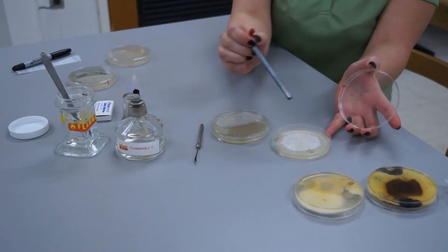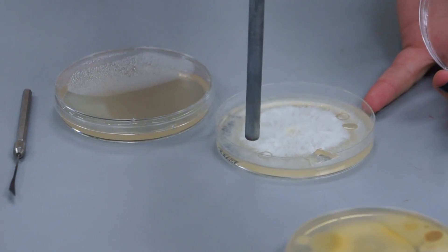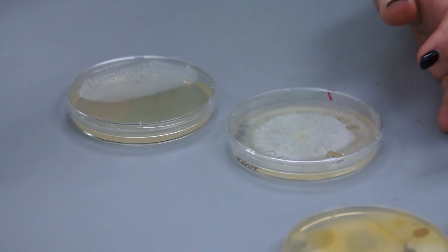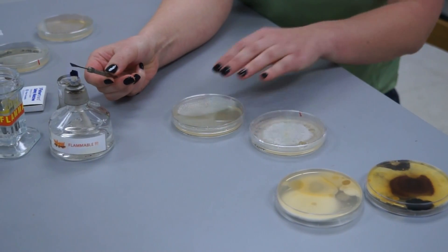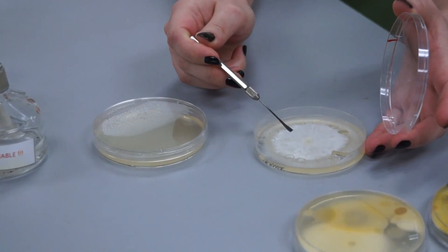Again, cool your tool by doing a few practice plugs, and use your spatula to transfer the culture onto the PDA plates. Again, cool your tool before use.